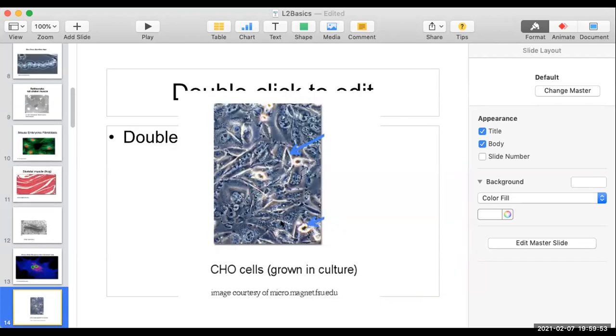How about this one? Hint: these are grown in cell culture. Yes, you've seen this before — this is phase with the characteristic phase rings.